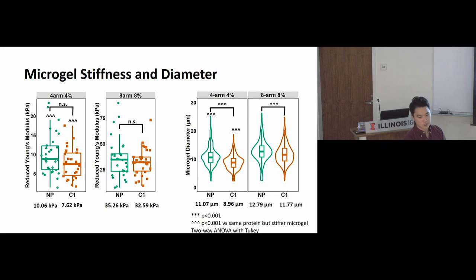Well, I mean, the cells are releasing their proteins, right? Yeah. But as for how I start the culture, they are all the same. So that's my basis on controlling for the proteins. Any protein that the cells might secrete, if it's hugely different from one type of environment to the other, it's because the environment is exerting it. So that's all part of the effects that we look at.